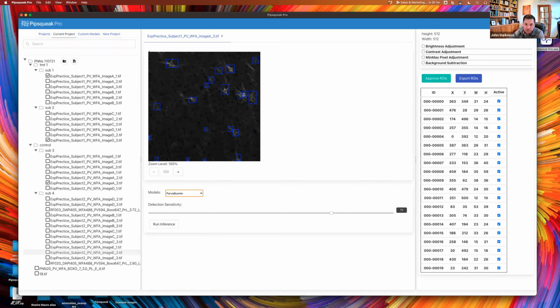So Larry, great question. Have we tested this on serial EM? We have not, but I think the biggest takeaway is that the AI should be able to detect anything that you would like to put in front of it, just with a little bit of fine tuning. The best way to do that is to bring it in, see if the image is something the AI is detecting currently, and then just make a couple of those additional annotations of what you're looking for, and give it a place to start training. I'd be happy to work with you or anyone else individually to test out your images and see if this is going to work for that application. Yeah, great question.